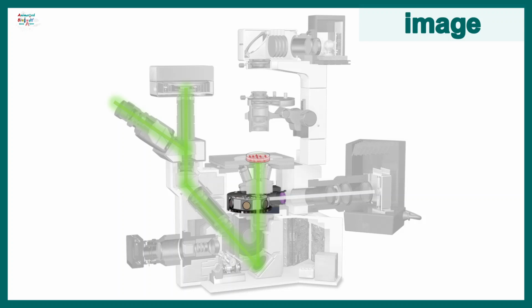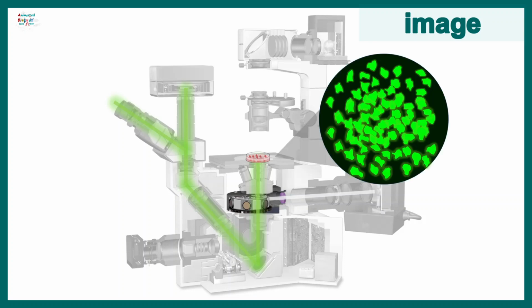And we can see the fluorescent specimen with our eyes. So both are possible. By changing a knob or pushing a mirror in the path, these pathways can be changed. That means whether it goes to the camera or to the eyepiece. And ultimately, we see or we image these fluorescently labeled cells. In this case, there are some cells which are labeled with fluorescence.